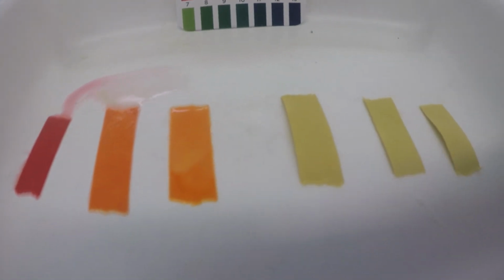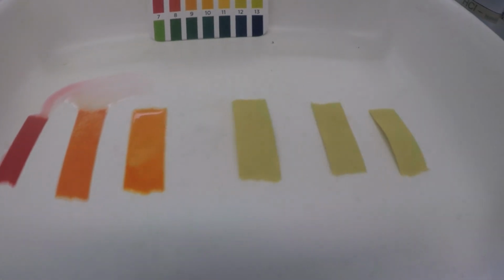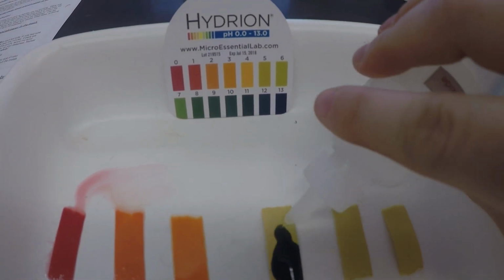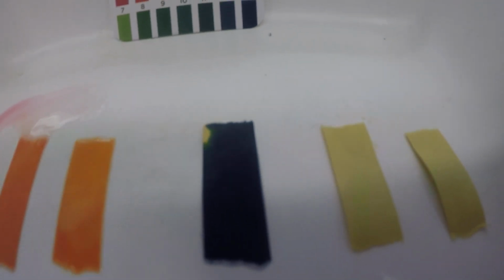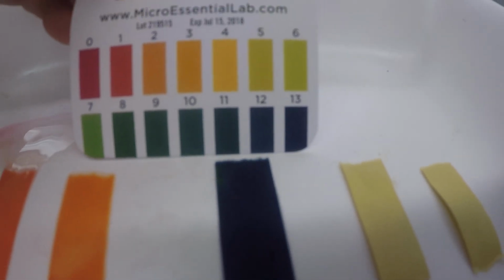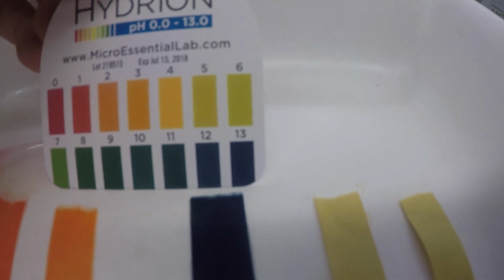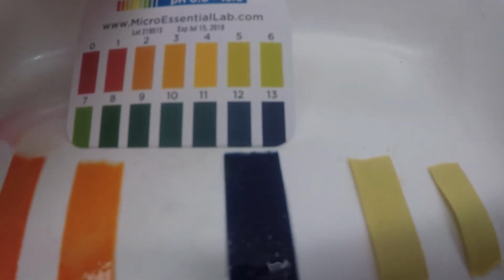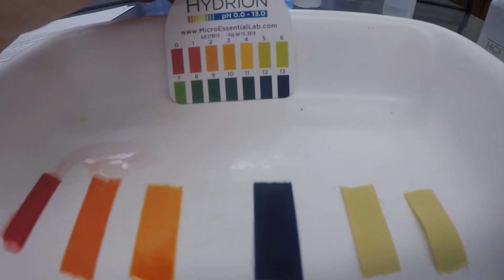Got our bases next. Got potassium hydroxide. I'm trying to get some good light here for you because it's hard to see. It's one or the other. Pick which one you think it is.